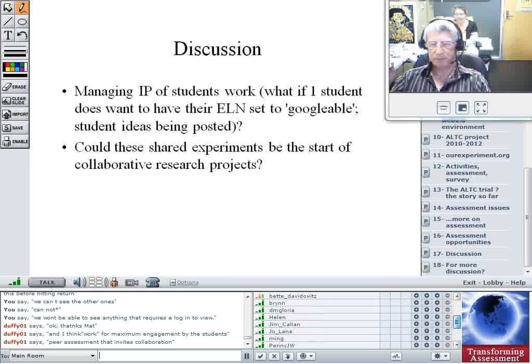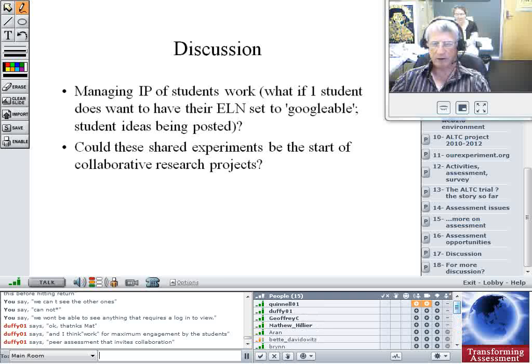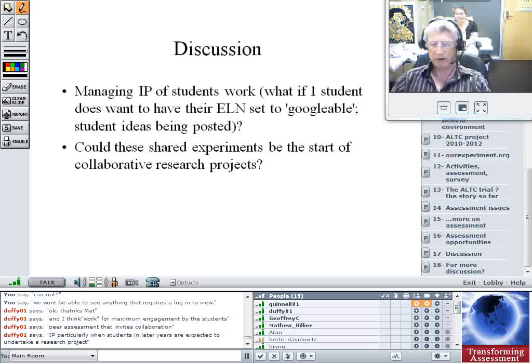Generation of new compounds where you may do slight modifications and then explore changes in electronic spectra, etc., where you might be making coordination complexes and so on as a shared experiment. Again, you've got research issues there.